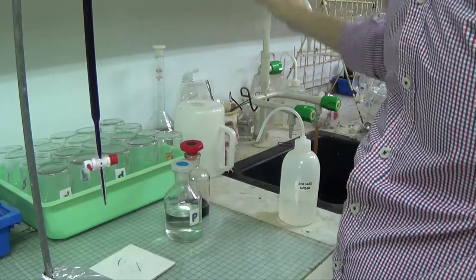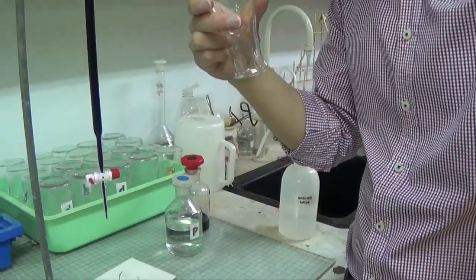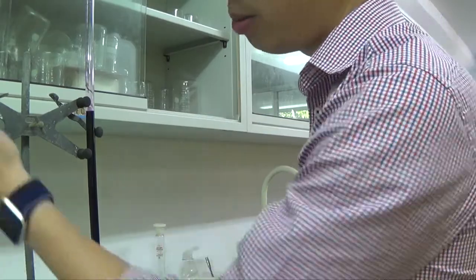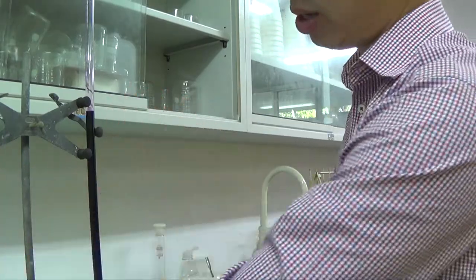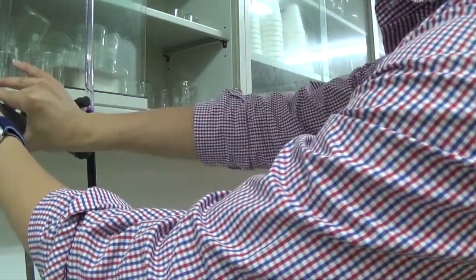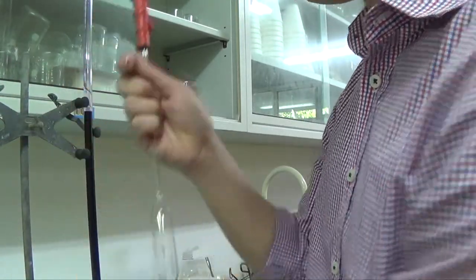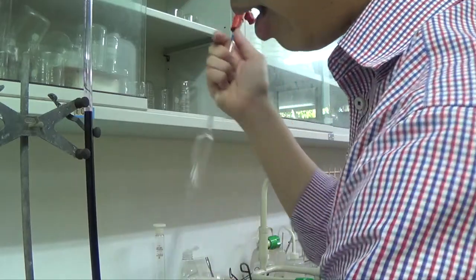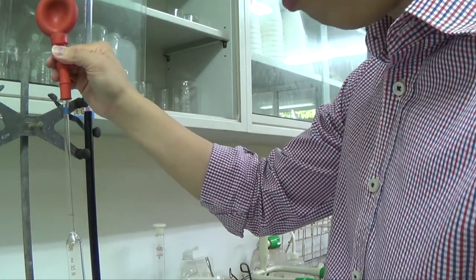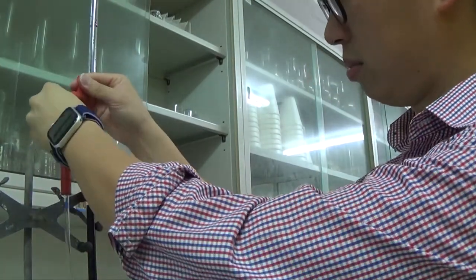be given, so that it could dry. But again, it does not matter if you have a little bit of distilled water inside, because remember, we were talking about how a little bit of water in there will not affect the mole of whatever you prepared into here with the right volume. So this was the other conical flask that I washed out. I'll try and do the accurate titration now. So strictly speaking, you need at least two or three accurate titrations that are within plus or minus 0.10 cm³.